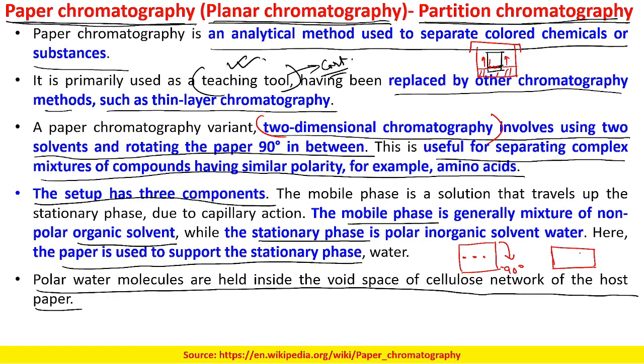Now your proper chromatography has all these peaks, not at the same level, sorry. Say one has moved somewhat upper, the other is at a lower position. So you will be having it like this. Okay, now you run the solvent in this fashion.